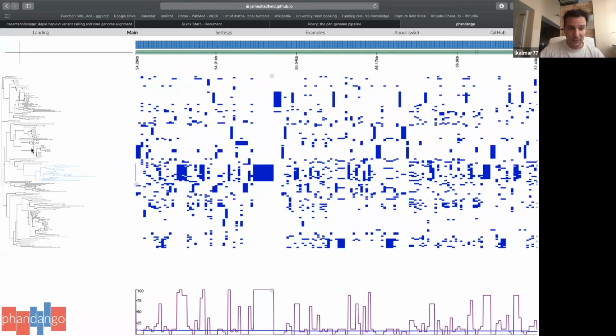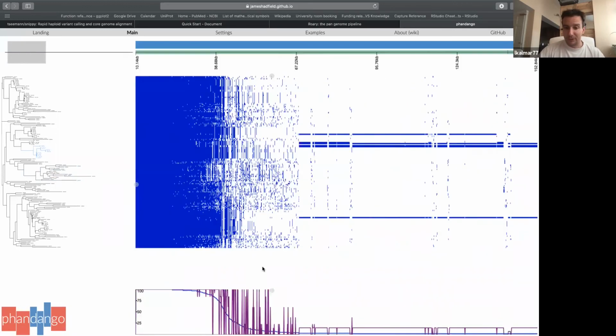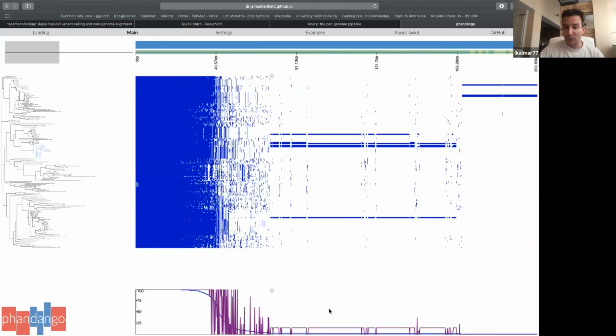The same thing if you look at, for example, this branch, then you can see that there is a high peak here. It's always good to see those ones which are out of this core or shell genome, but have a high peak. So this is one of the ways you can, for example, find phenotype-specific genotype information.